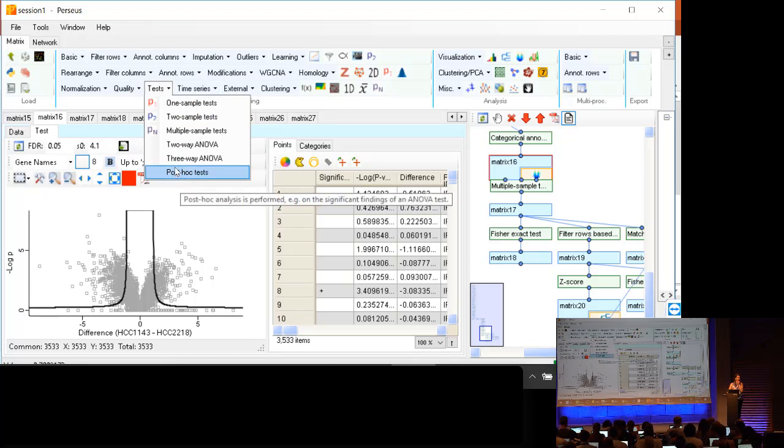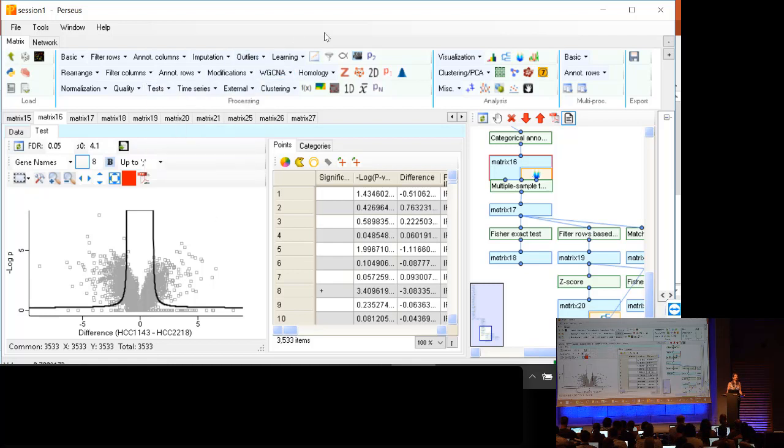Yeah, and the problem is with the previous version I use, that then it's not possible to make it visible in a volcano plot because there's no p-value for the y-axis. Okay, I would then advise to check the latest version, and if the problem still persists, to use the complaint form or the bug form. Okay, good, thanks.